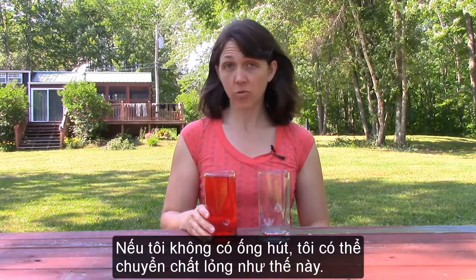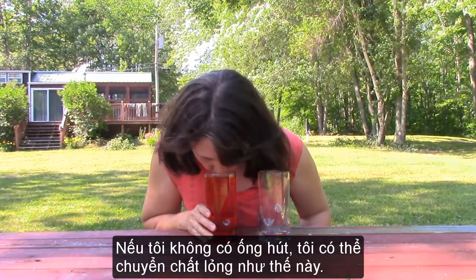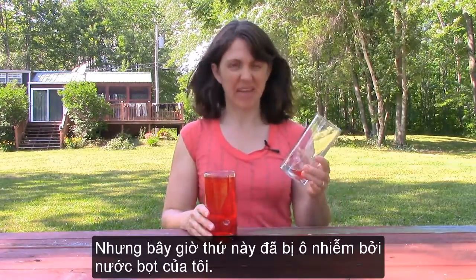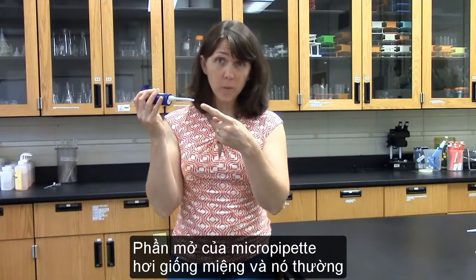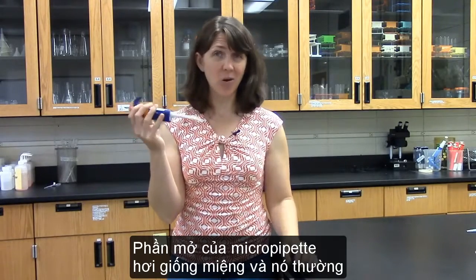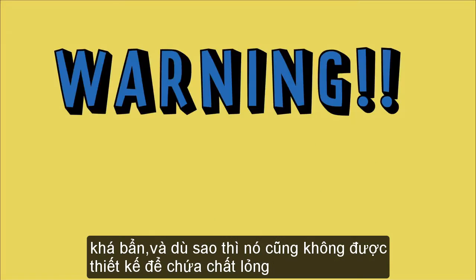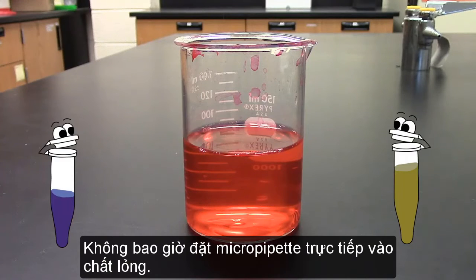If I didn't have a straw, I could transfer the liquid like this. But now this is contaminated with my spit. The opening of a micropipette is a little bit like a mouth in that it's usually pretty dirty, and it's not designed to hold liquid anyway. Never put a micropipette directly into liquid.